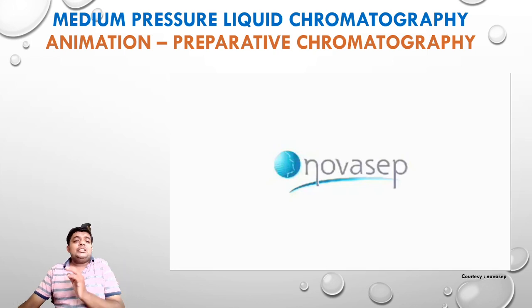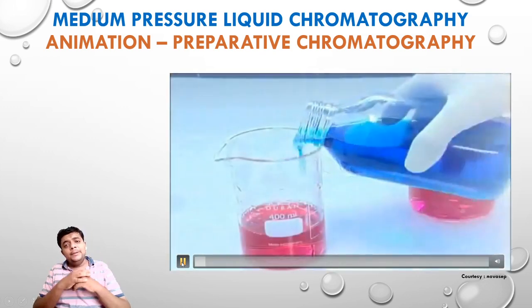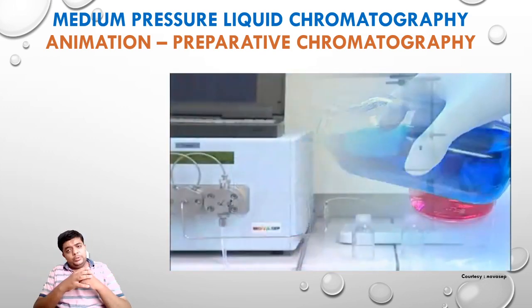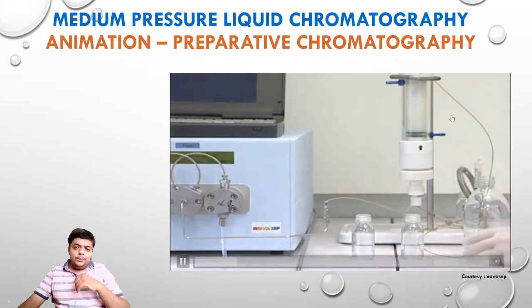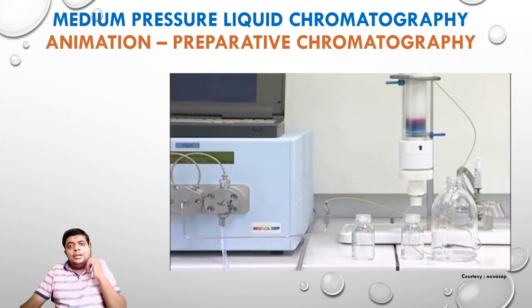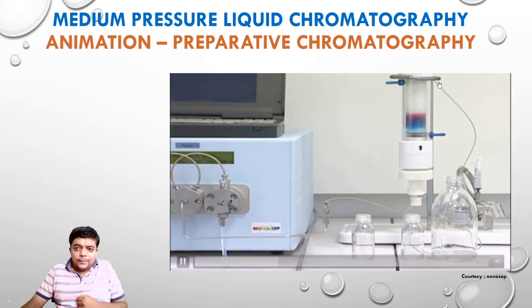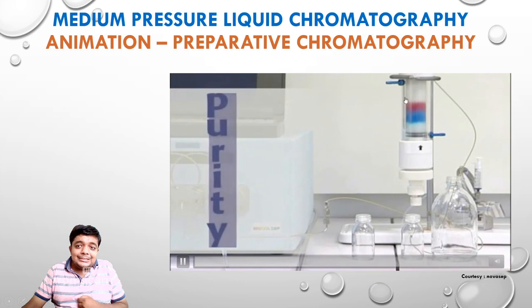I'll be keeping on explaining to you along with the video. So keep your eyes on the video. You can see over here that we are mixing two components, a red color and a blue color component, and it is now fitted into this column and it is allowed to run. The mobile phase along with the components is allowed to run in a stationary phase column. You can see over here the two components are slowly and gradually getting separated.